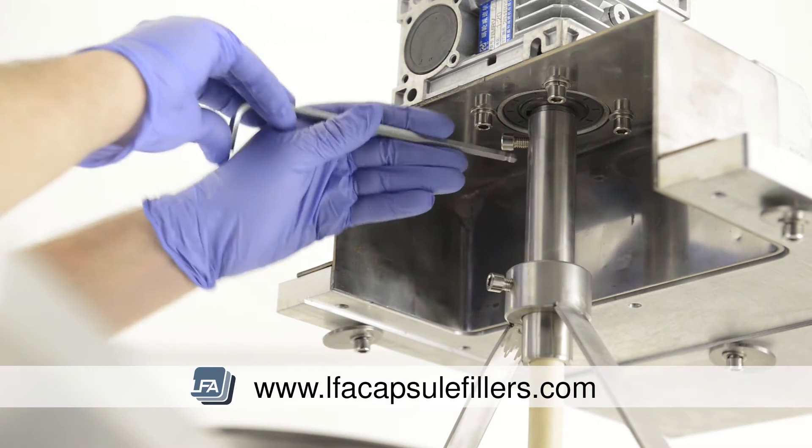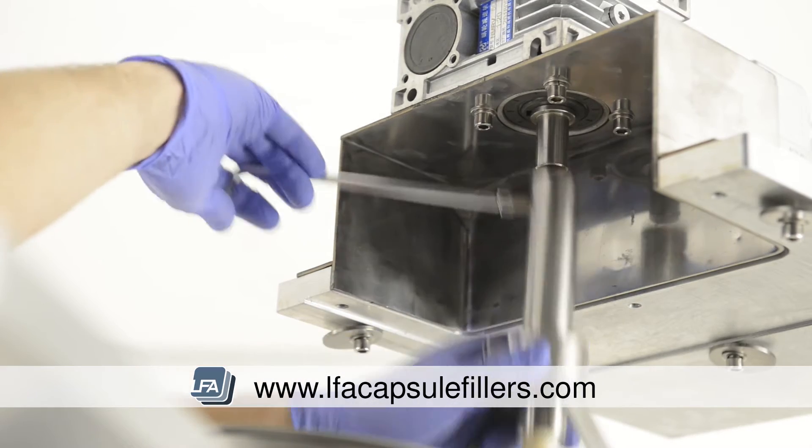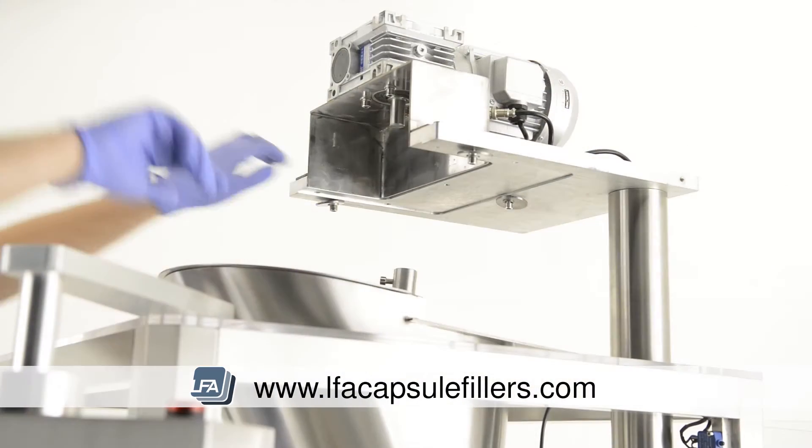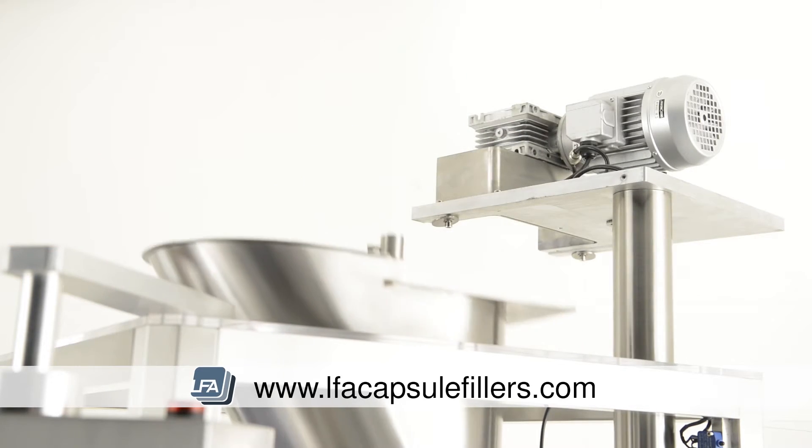At the top of the auger paddle, there's a bolt. Undo this and take the weight of the auger filler. Remove it and place it to one side. Then rotate the top section so it's out of the way. You're then able to lift the hopper out of the machine.